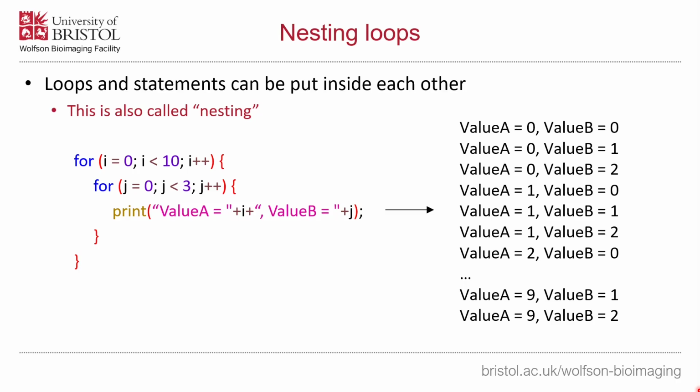So you'll be saying, right, well, for the first object, I want to compare the distance to all other objects in that particular image. Then you want to move on to the second object, compare all different objects in that, and move on to the third, compare all distances to all other objects, and so on. So in order to do that, you would basically have your first loop, which is iterating over all objects, and then in that case you would have another loop iterating over all the objects again. Of course, they would both be going to the same number.